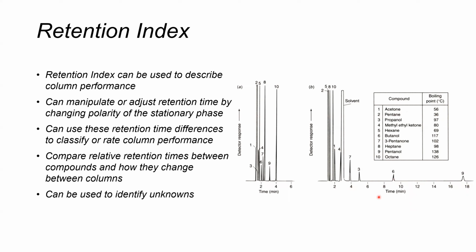And this is presumably because of their greater affinity for the stationary phase if the column has been changed. As a result, we see that there is now this greater retention time, so it takes longer for them to be eluted. Some of the other orders don't really change too much, although some get shorter and some get longer.